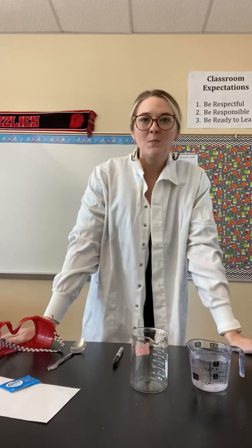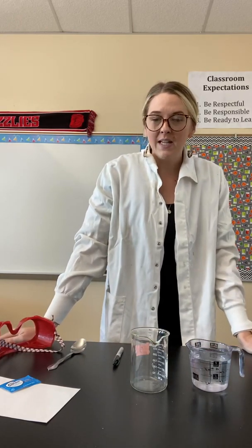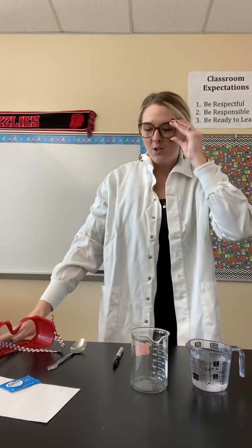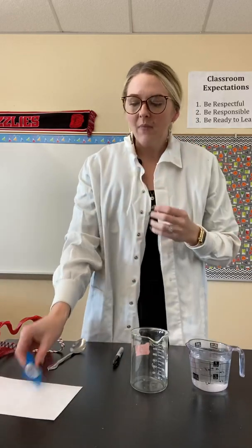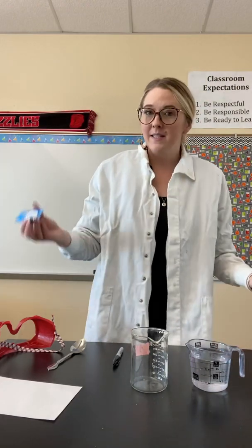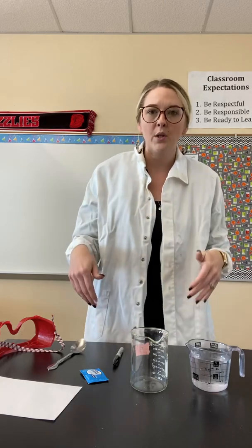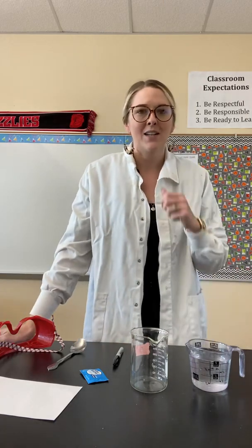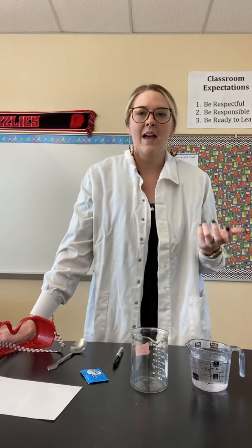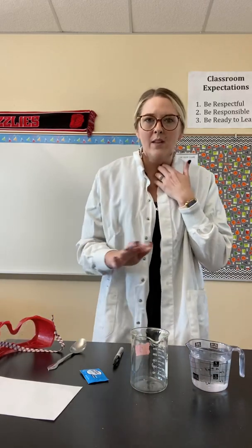Hey students, welcome to the lab. I am going to be doing a lab demo for surface area and looking at reaction rates because of different surface areas. So today I am performing the Alka-Seltzer lab. The reason why you're watching this is because you are not able to do this at home, so I'm going to be doing it for you. What you're going to be responsible for is writing your hypothesis, timing the reaction, things like that. Please make sure that you have something to time with, and I'll do everything else.